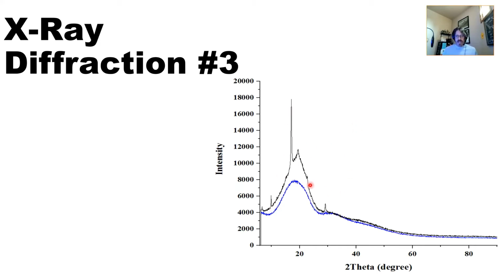So this black line exhibits a level of crystallinity. We've processed the material in this black line differently, so we imparted a degree of crystallinity to our polymeric specimen, and we can interpret that by X-ray diffractometry, by looking at these peaks, and where they lie tells us some stuff as well. We'll get further and further into this in the next two lectures. But first we need to talk a little bit more about crystallinity.